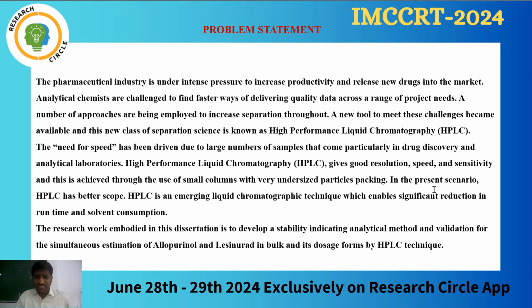In the present scenario, HPLC has better scope. HPLC is an emerging liquid chromatography technique which enables significant reduction in runtime and solvent consumption. The research work embedded in this dissertation is to develop a stability indicating analytical method and validation for the simultaneous estimation of allopurinol and Lesinurad in bulk and its dosage form. So we can use this method for pure drug as well as for different dosage forms by the HPLC technique.